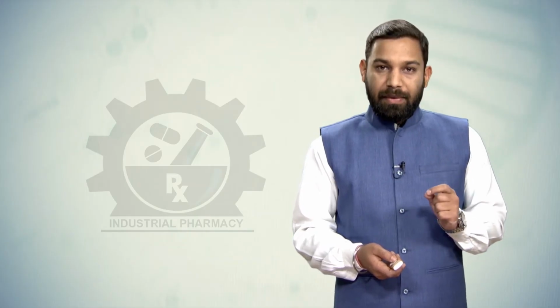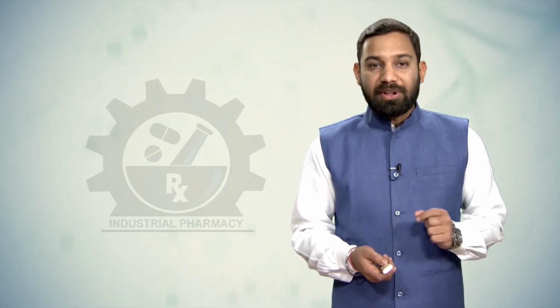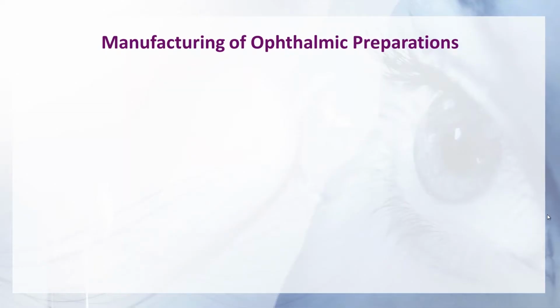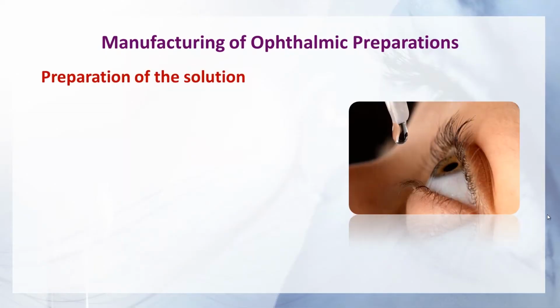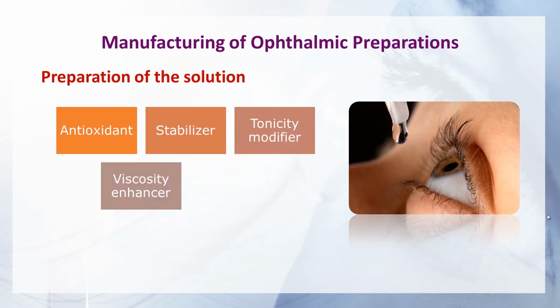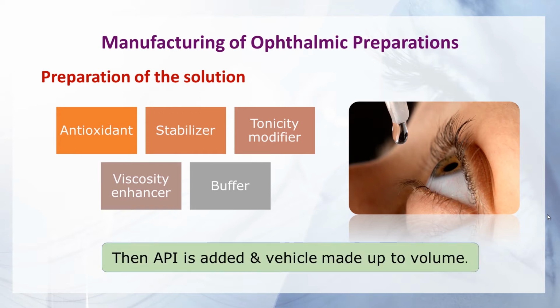The first step in the preparation of eye drops is the preparation of the primary solution. The aqueous eye drop vehicle containing any necessary preservatives, antioxidants, stabilizers, tonicity modifiers, viscosity enhancers or buffers should be prepared first. Then the API is added and the volume made up to the required level.